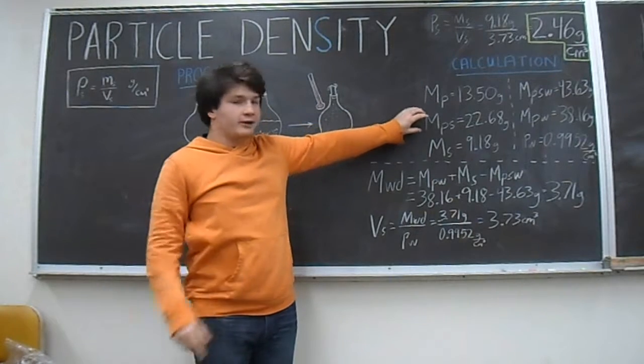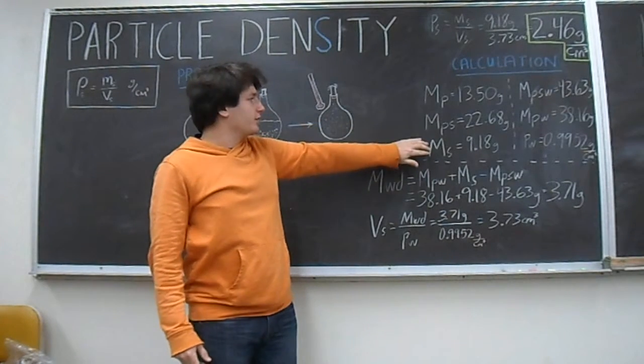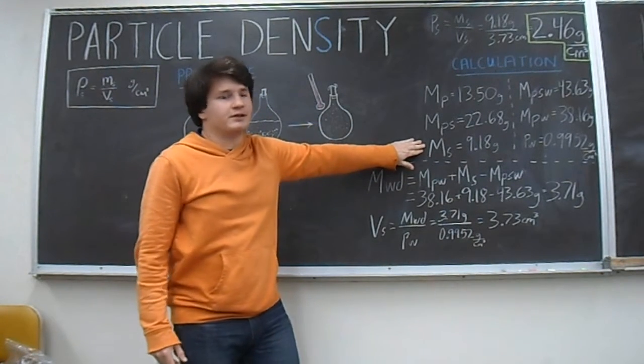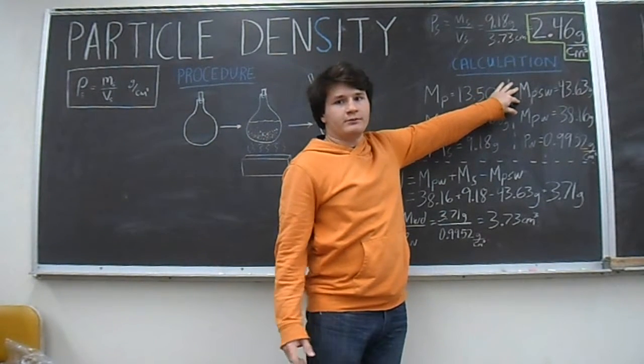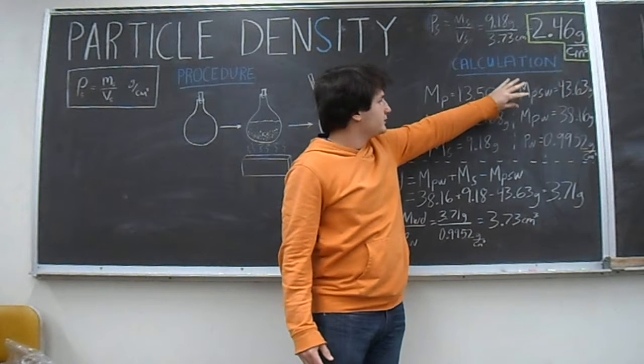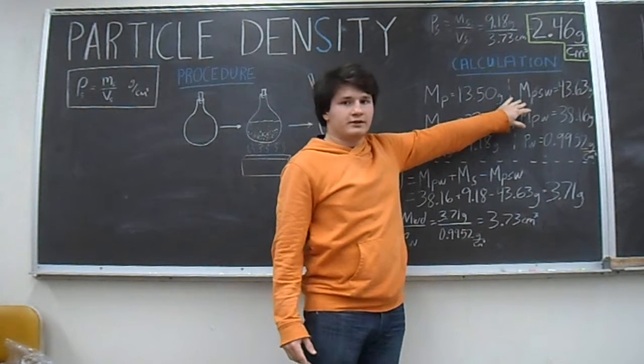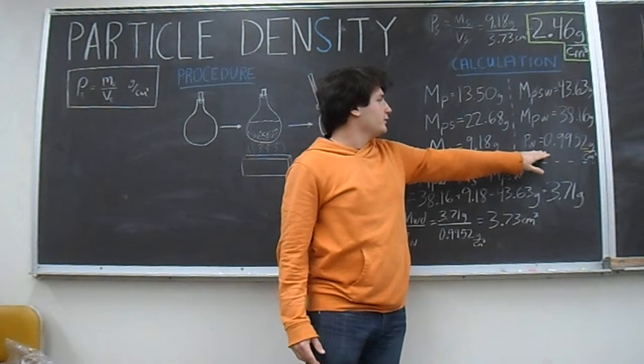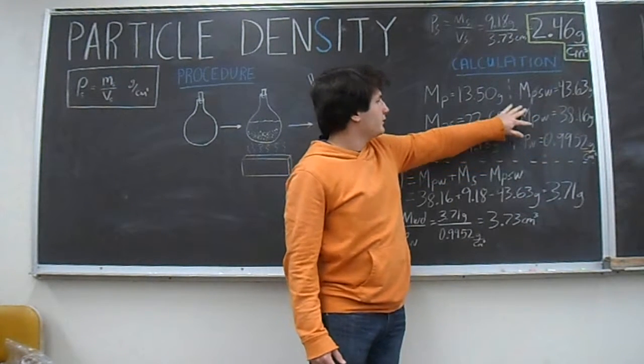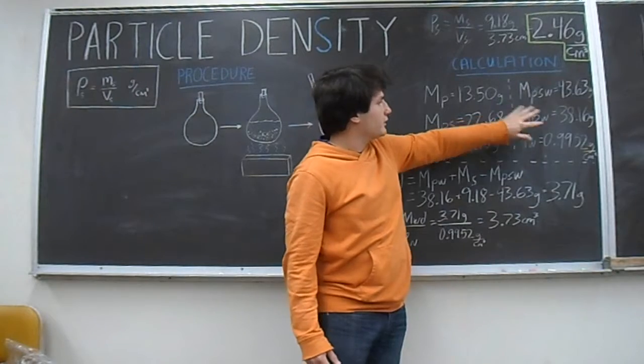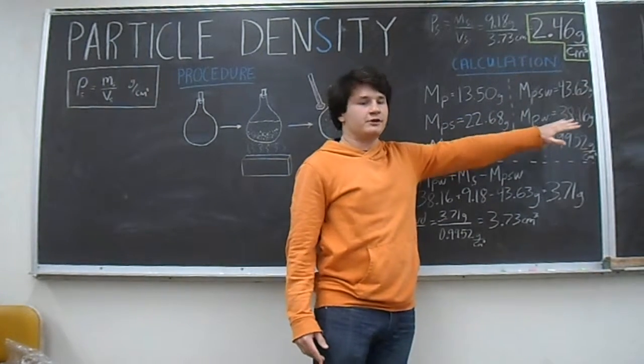After massing the pycnometer and the pycnometer with soil, you can then find the mass of the soil by itself. Then you fill the pycnometer with water, and you can find the mass of everything combined. After you empty it and take the temperature of the water, you can use a chart to find the density of the water at that temperature. Then you refill the pycnometer with water and take the mass of the pycnometer with just the water.